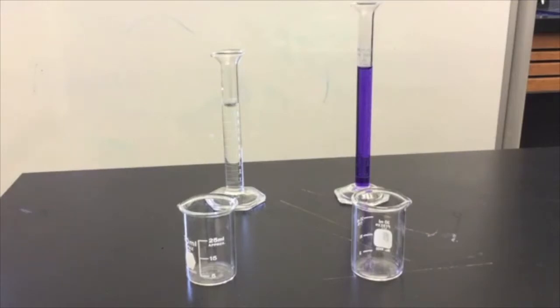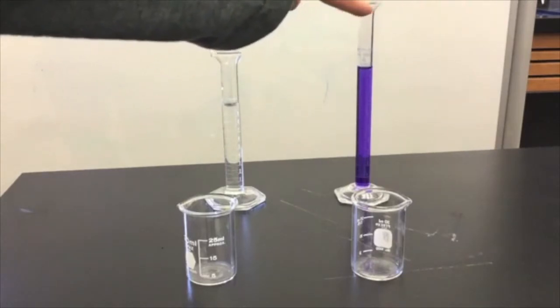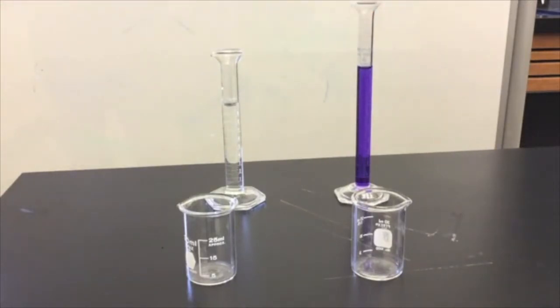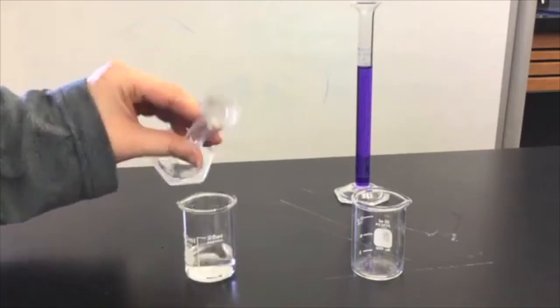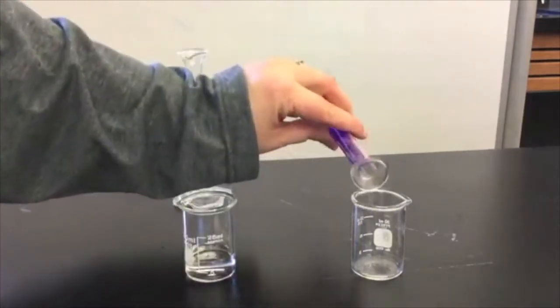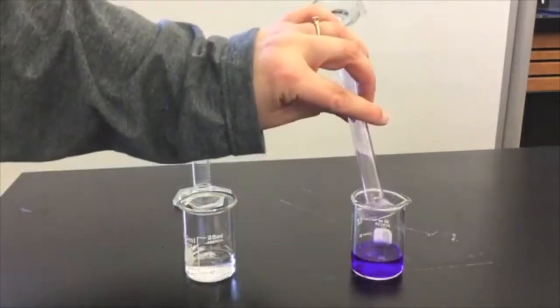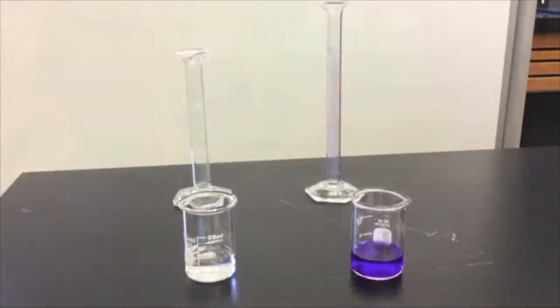Begin by measuring 10 milliliters each of the sodium hydroxide and the crystal violet. Pour each of these into separate small beakers. Then place the beakers into an ice bath, this way they will be very cold when it is time to do our second trial at a lower temperature.